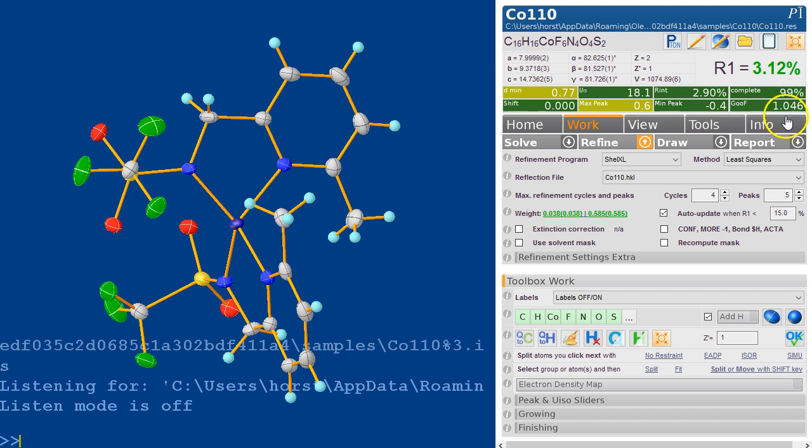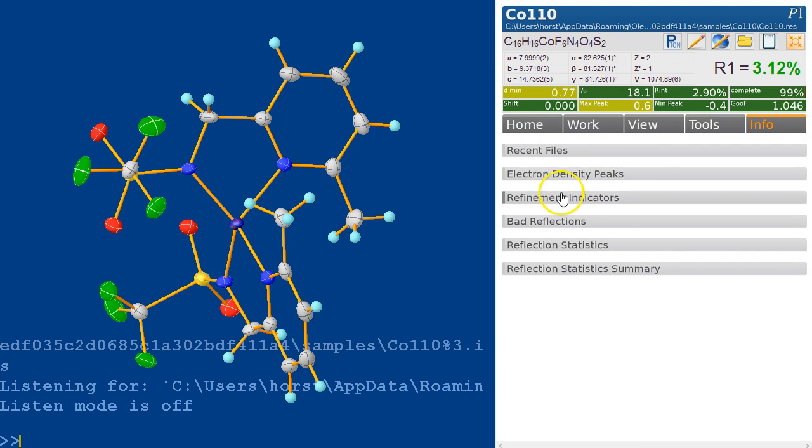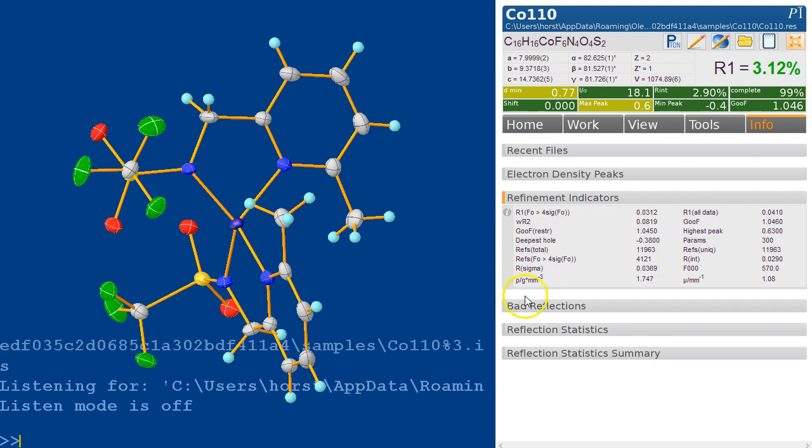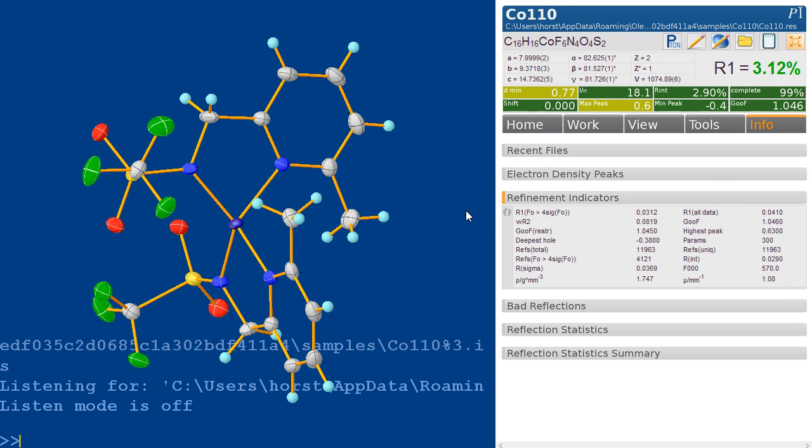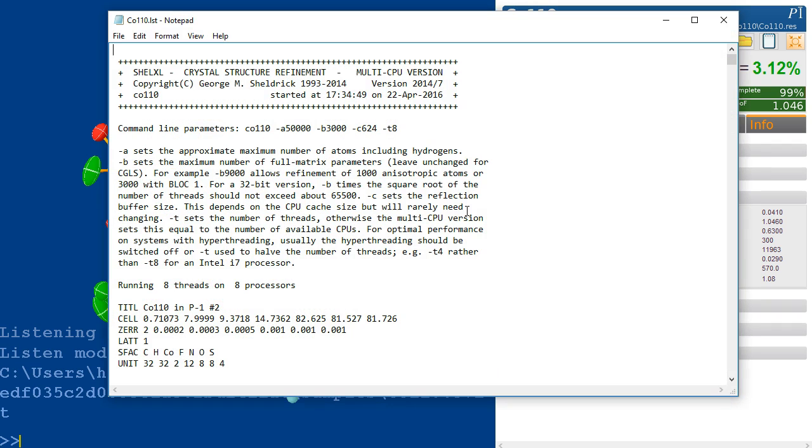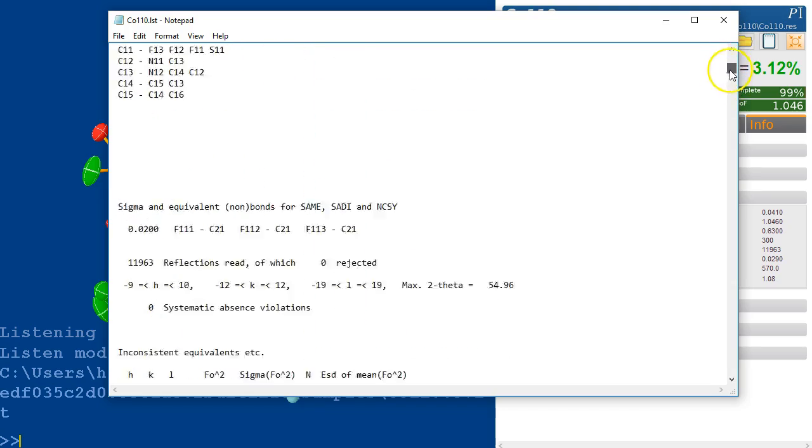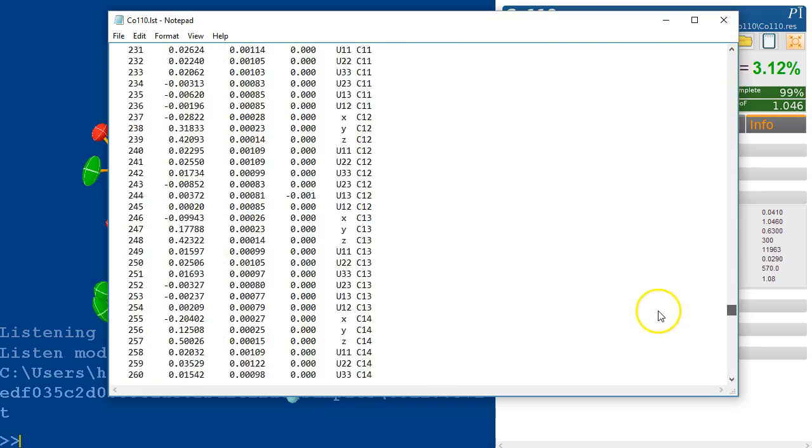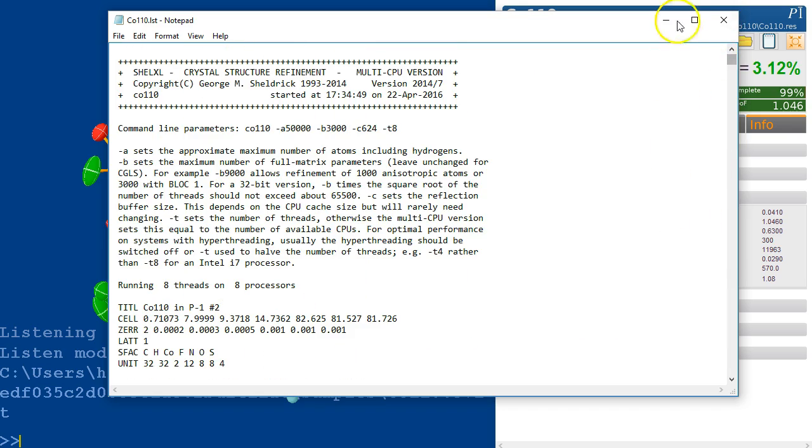We extract some information out of the files, for example, the refinement indicator. So this is a quick view into the listing file. Of course, if you did want to examine the listing file, it's edit LST. So this brings up the full listing file as ShellX has produced it. You can look at this file here.